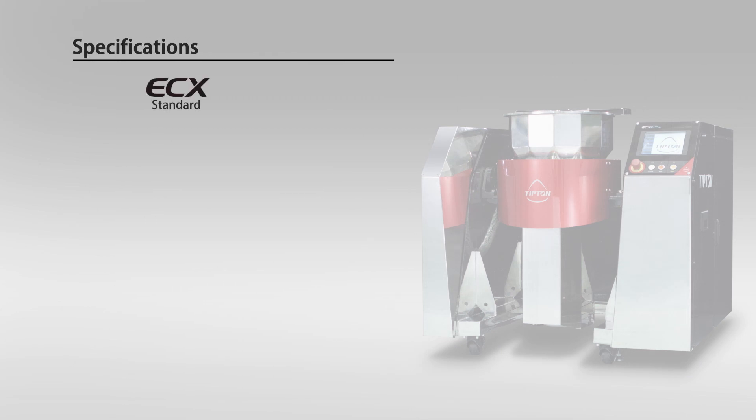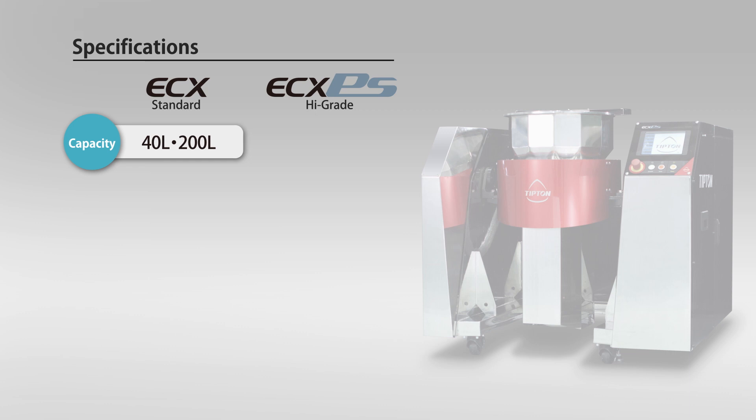Depending on the purpose, it is possible to choose the standard type, which is suited for coating, or the high-grade PEAS type for multipurpose processing, including mixing, granulating, polishing, and sizing of items. As for capacity, each type comes in two sizes: 40 liters for small volume production, and 200 liters for mass production.